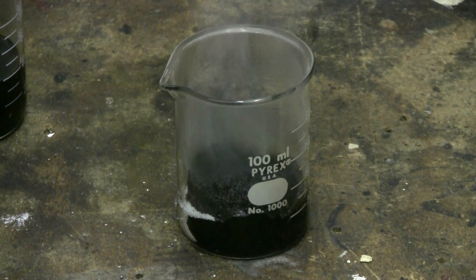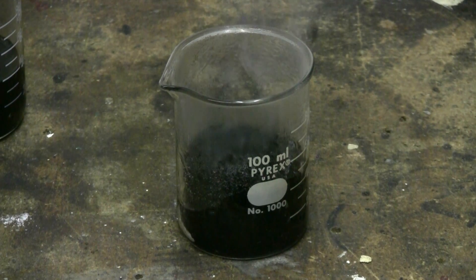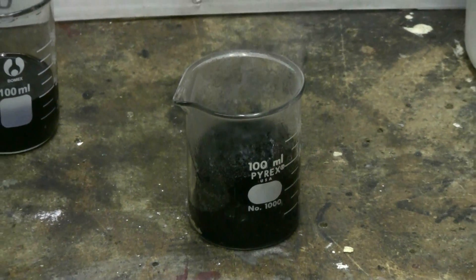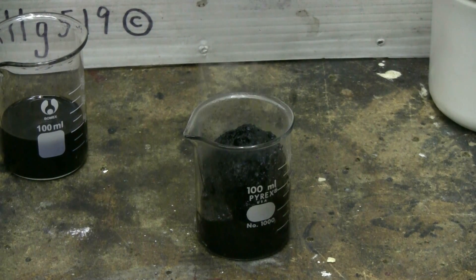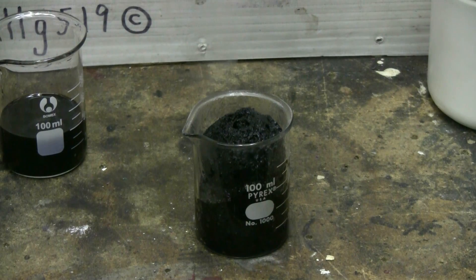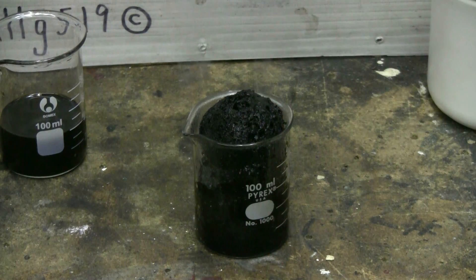And we are getting a reaction, so that sulfuric acid, despite its filthy brown colour, must have some degree of concentration to it. I'm getting steam coming from the beaker, and the sugar is clearly being broken down into a soggy mass of carbon.